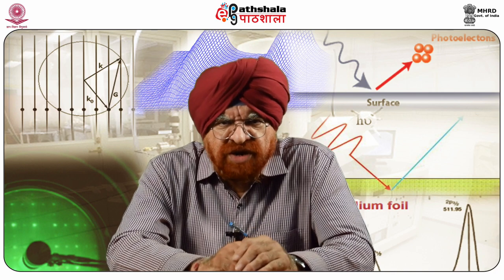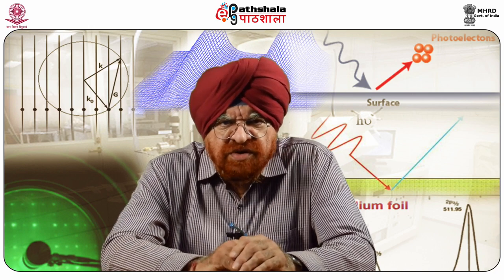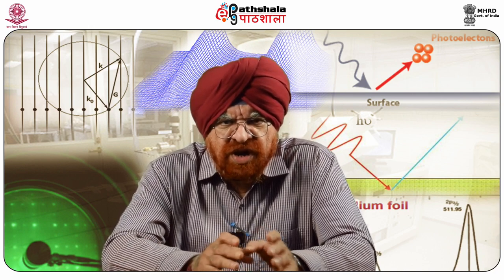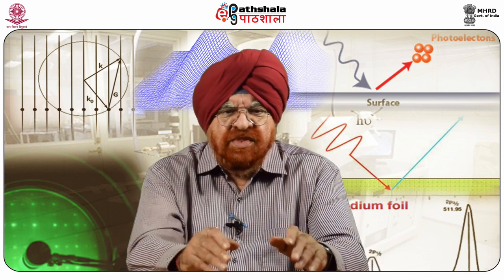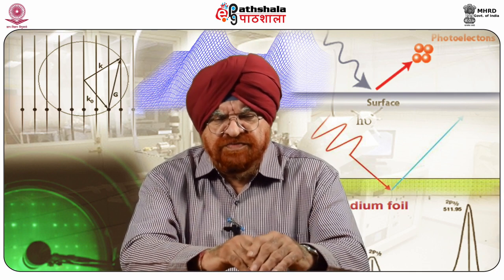The sample is bombarded with high energy X-ray of energy hν. Each electron is held in place by the nucleus with a characteristic binding energy. X-ray photons of energy hν collide with an electron. The energy of the photon is imparted to the electron, and if this energy is greater than the binding energy, the electron will leave the atom and carry with it excess energy in the form of kinetic energy.